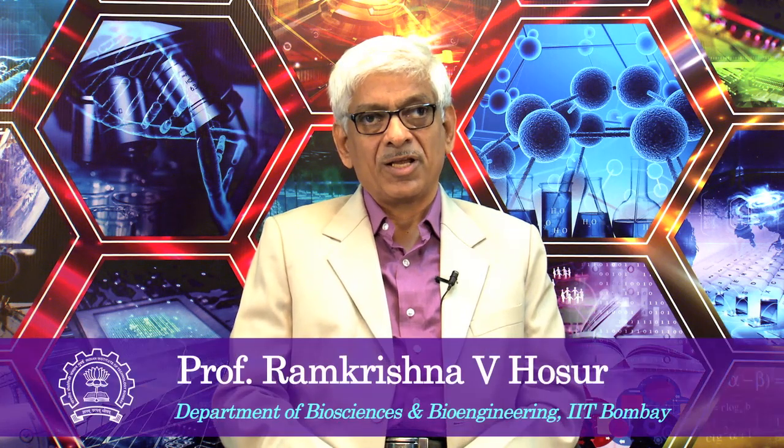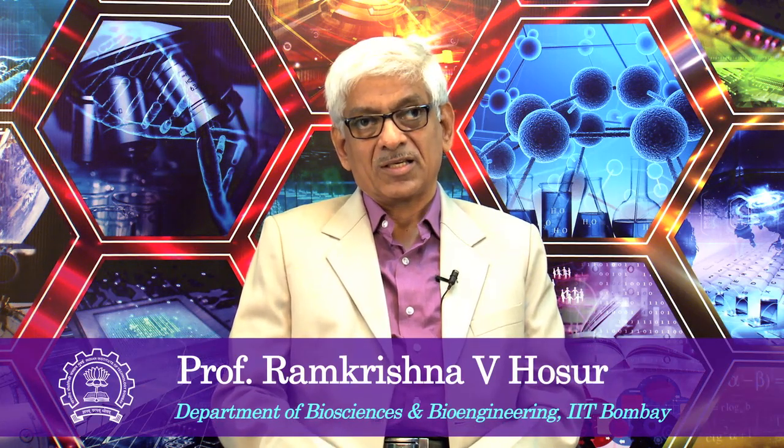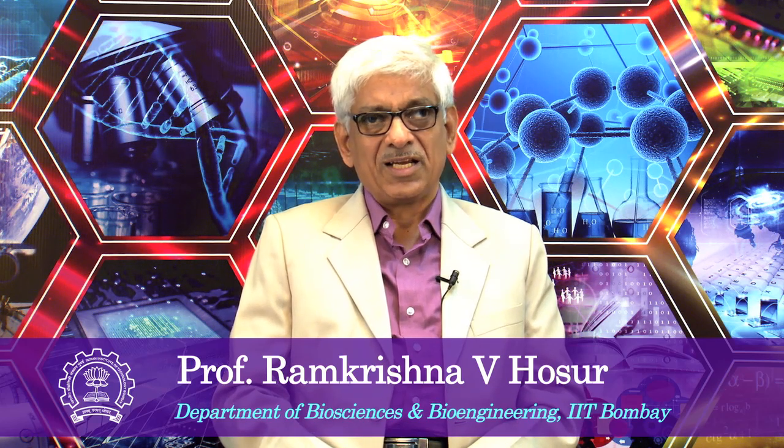So, today we are going to start a new topic, namely multidimensional NMR spectroscopy. This is basically an extension from the Fourier transform NMR, which came up in 1966 and that caused a revolution in NMR applications. Things which could not be handled earlier could be handled because of the sensitivity enhancement it allowed.